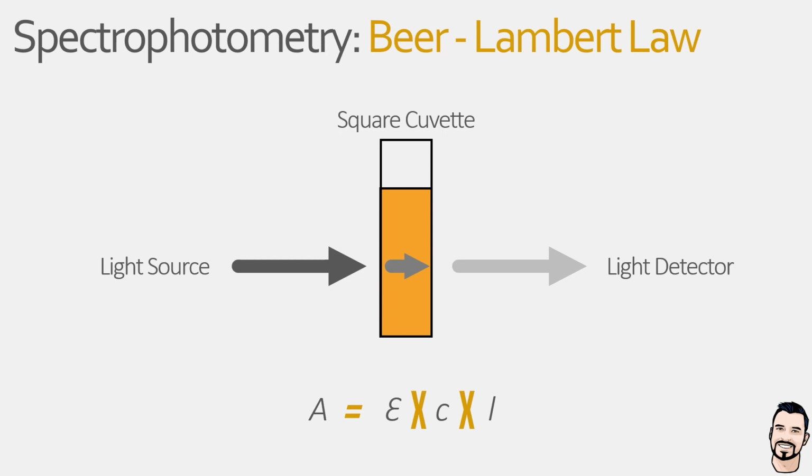Now the way in which this all works is the spectrophotometer will shine light of a known intensity from the light source, which is known as I0, and record the amount of light reaching the detector, known as I1. Now it's the properties of the solution which change the light being detected, and so if we take our Beer-Lambert equation, we can see that the molar absorption coefficient of the solution along with the concentration will affect the absorbance of light, as will the path length.